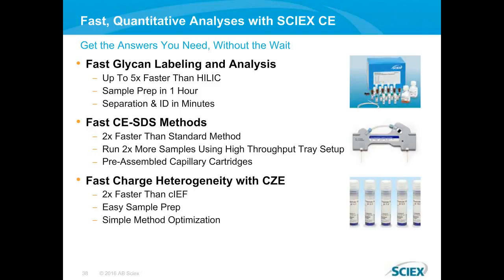Our next question, with the fast CE-SDS method, does it reduce the conditioning time of the capillary? The conditioning time of the capillary is not changing, so you're still required to do the occasional conditioning in the method. The thing that changes there really is the separation time, because you're going from right to left in the capillary as opposed to left to right, which is the longer path of separation.